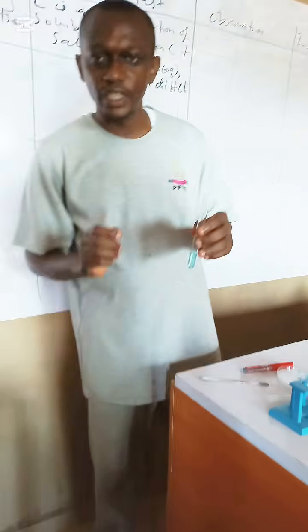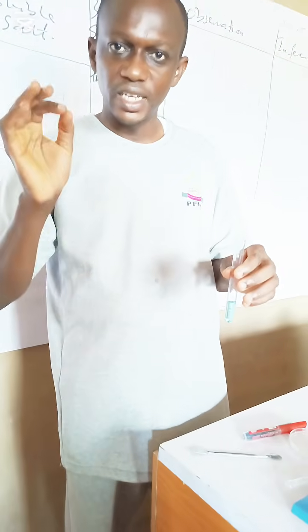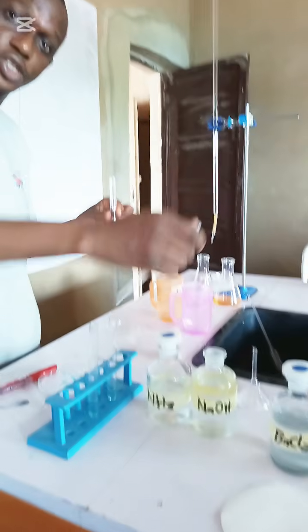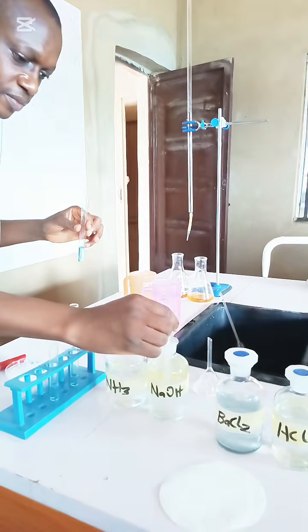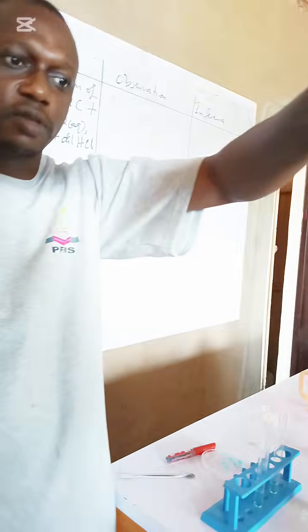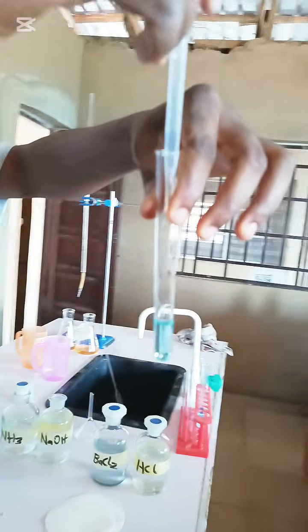If you have to put it in drops, it means we take this sodium hydroxide and we put it in drops. So let's see what happens over there. Looking at it, we put it in drops. Film it in this so that you can see it very well.